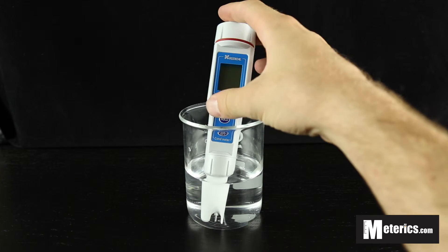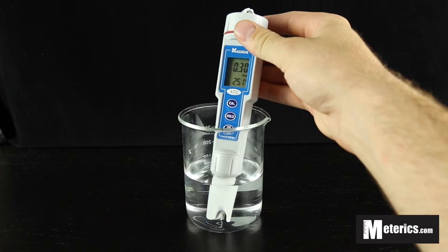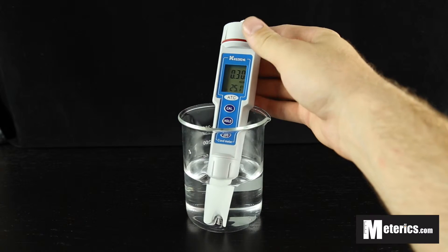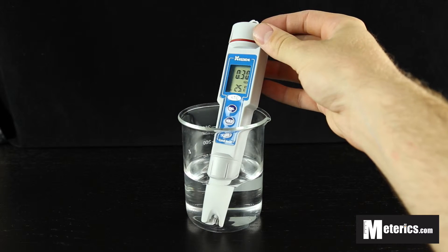So all you have to do to get started here is simply turn this on and submerge it in whatever you're going to be taking a measure of. As you can see, it's been sitting in this water for a little while, so we get a reading of 0.30 microsiemens per centimeter.